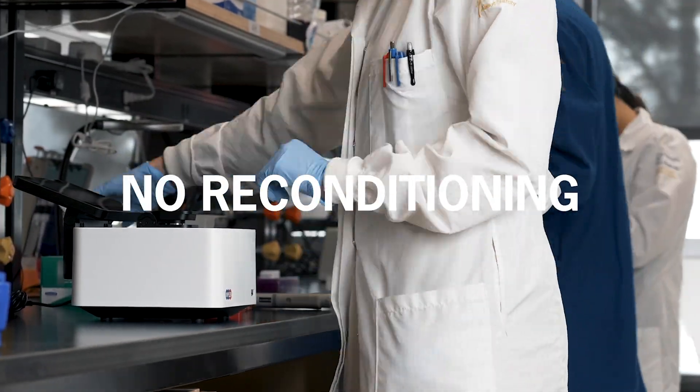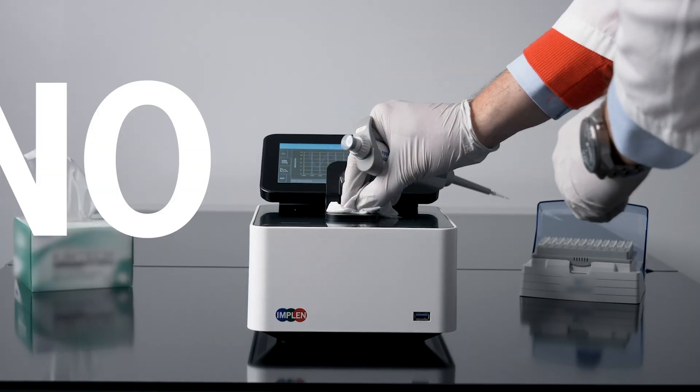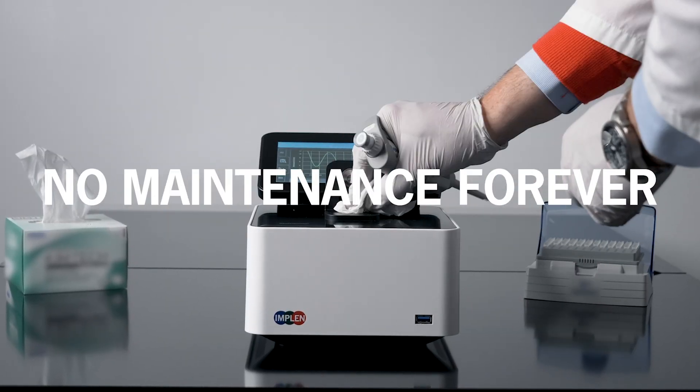German-engineered without the need for service, recalibration, or regular maintenance for its entire lifetime.